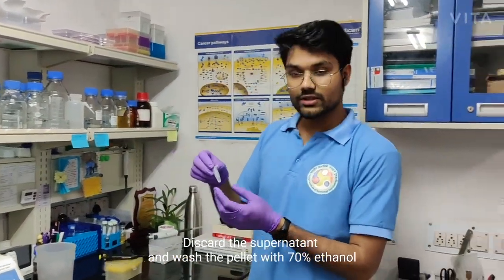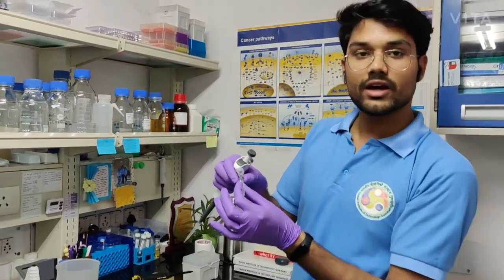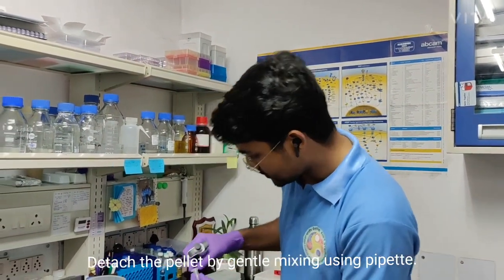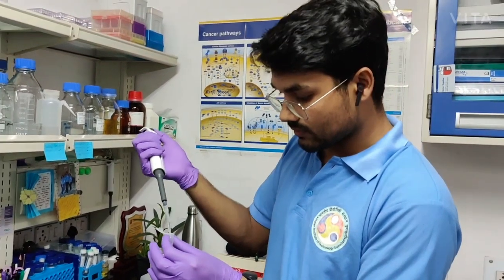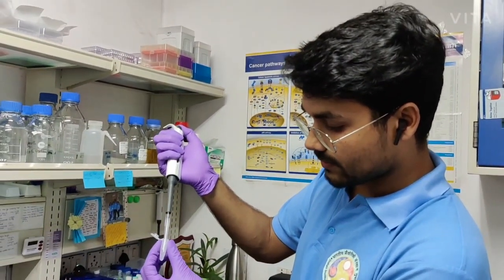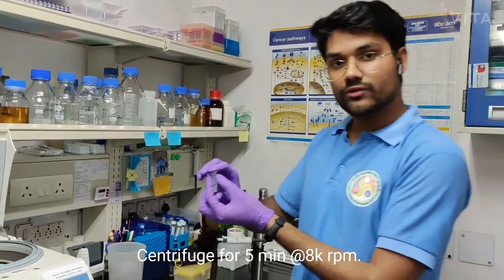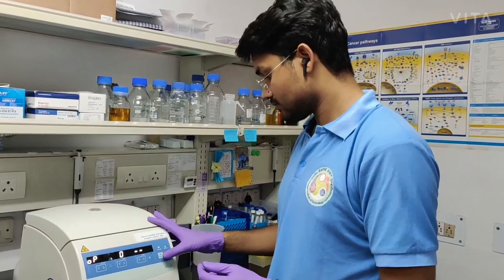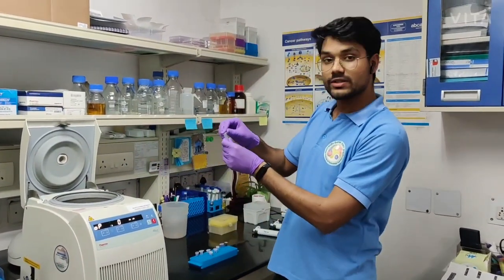Now after the centrifugation, we will discard the supernatant and wash the pellet with 70% ethanol. As the RNA quantity is very low, we can't see this pellet. So we will just blindly add the 70% ethanol and try to detach it from the bottom. We mix it 2-3 times. Now, after the mixing, we will again centrifuge it for 5 minutes at 8000 RPM at 4 degrees Celsius. Now, we'll discard the supernatant.